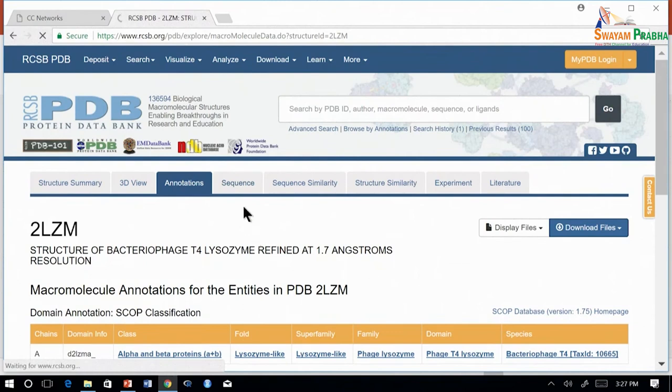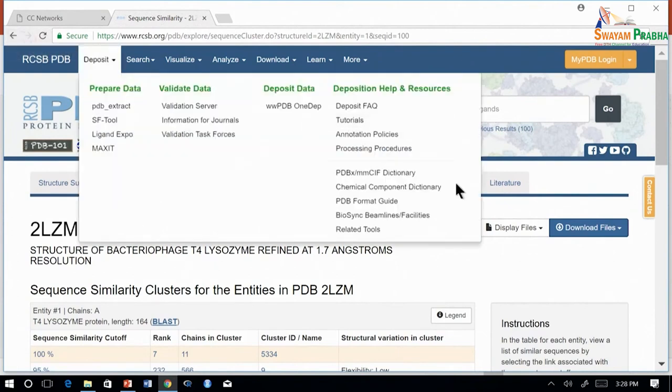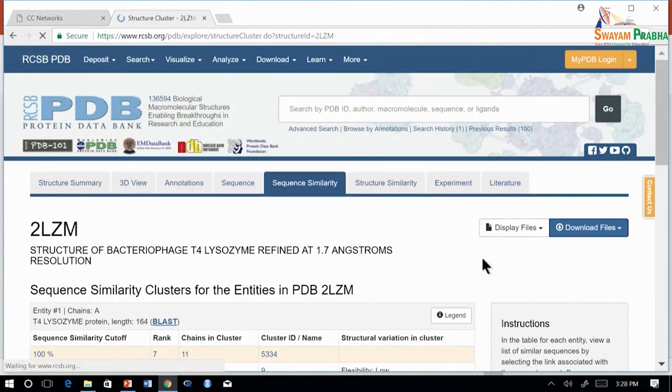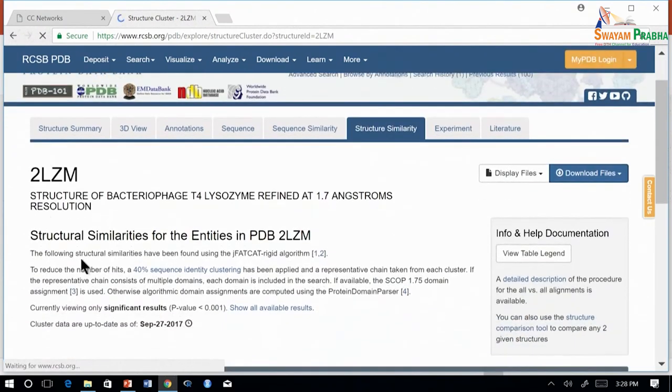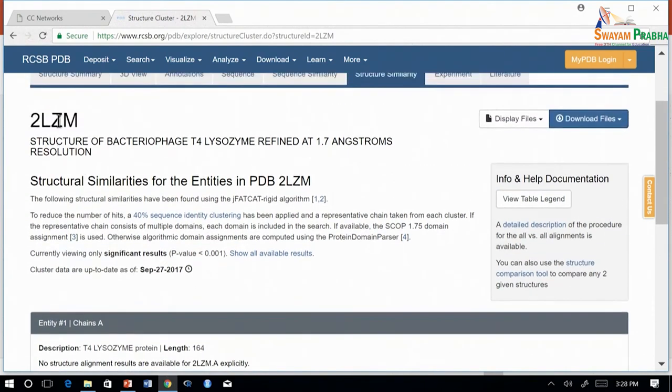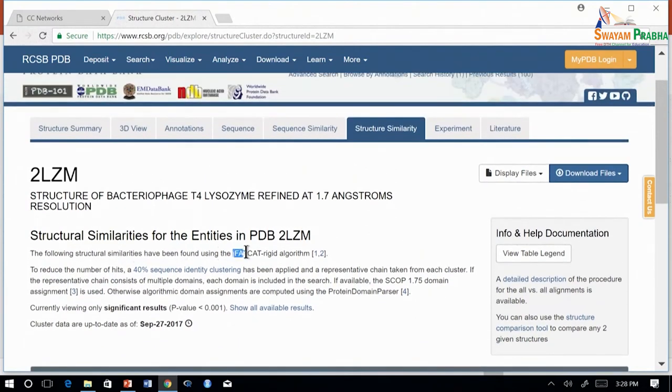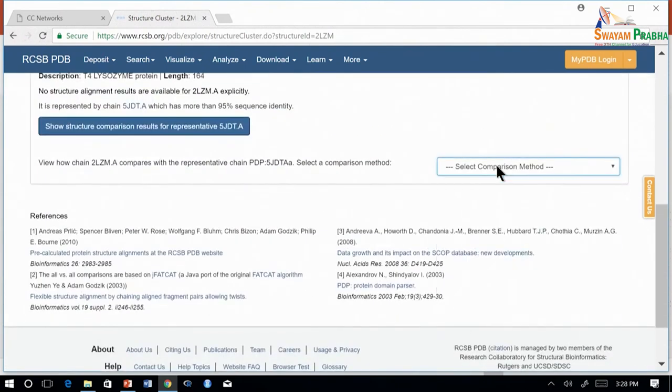The sequence tab to know the structures or the sequences in that cluster. Structural similarity. Here we can see all the structurally similar entities in PDB which match to LZM. Structure similarity is done using the FATCAT-rigid algorithm. You can also choose other algorithms here.